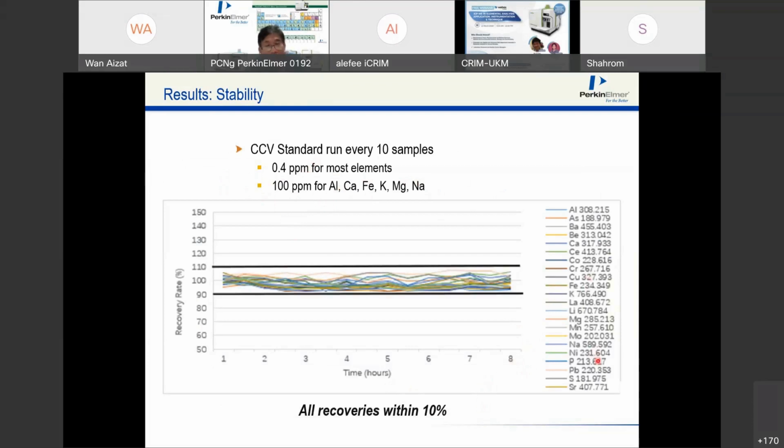This is the geological sample, like I would say, to be analyzed on ICP-MS. For the same sample, there are also people who analyze on X-ray. X-ray will be press powder or fusion, then analyzed on X-ray. Let's say using acid digestion, you'll be on ICP-MS for this element for raw geological sample.